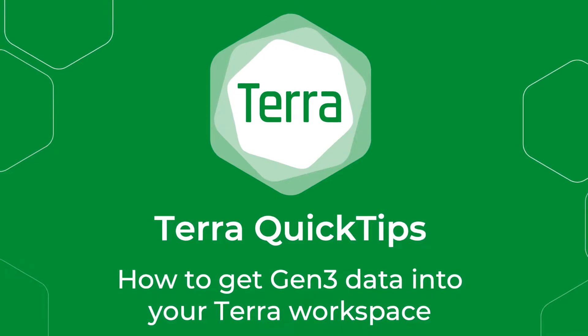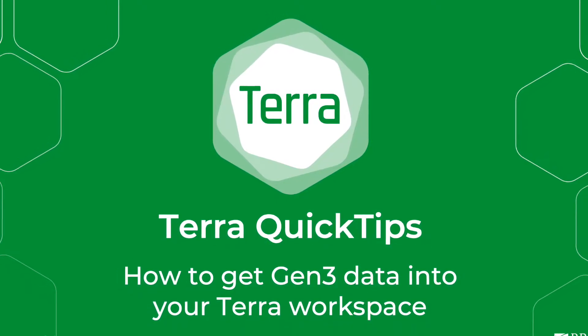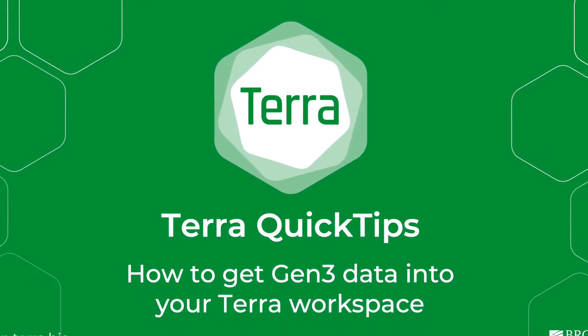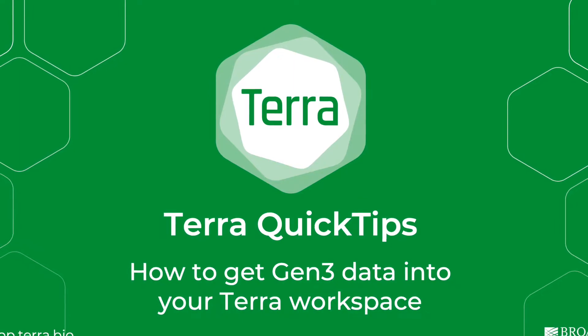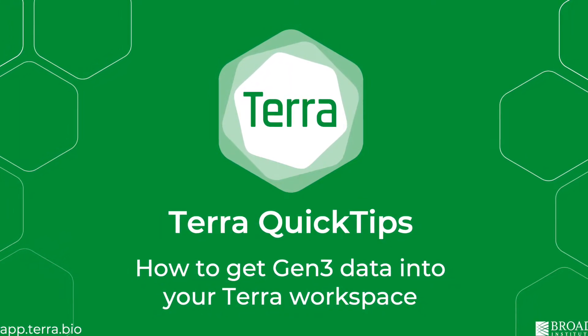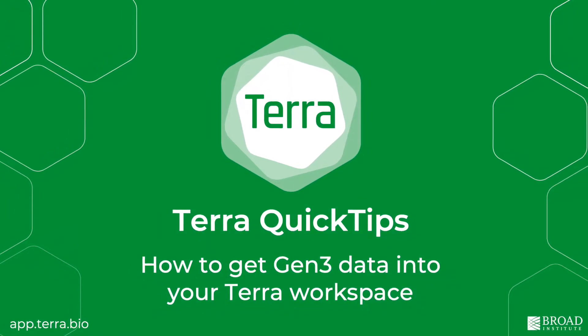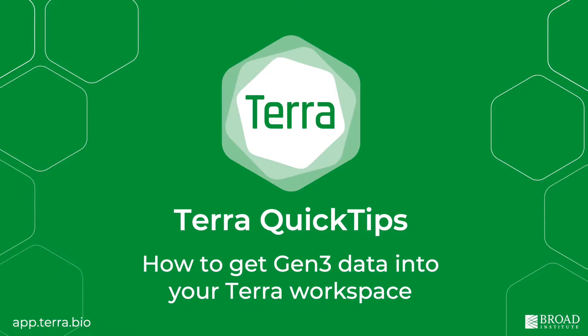Hi, I'm Ali from the Terra team and today I'm going to walk through how to get data from the Gen3 platform into your Terra workspace for analysis.